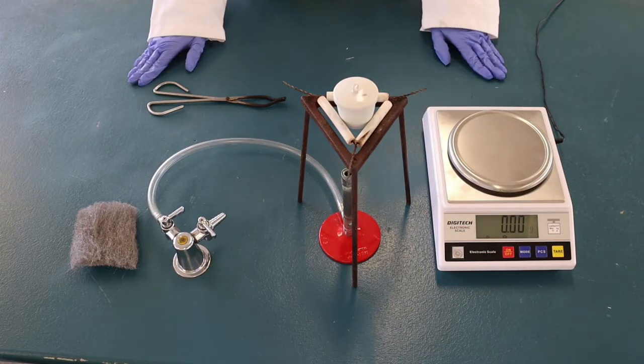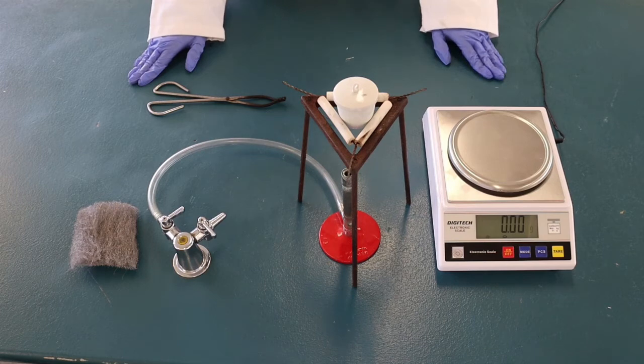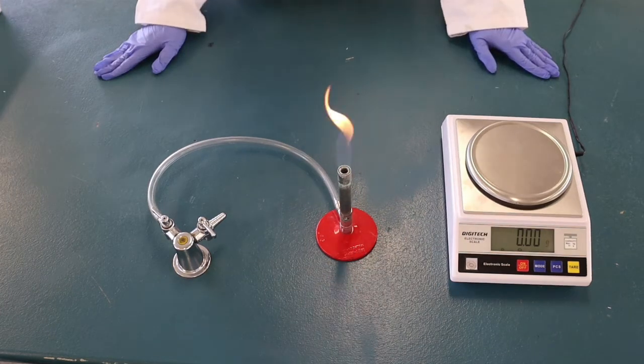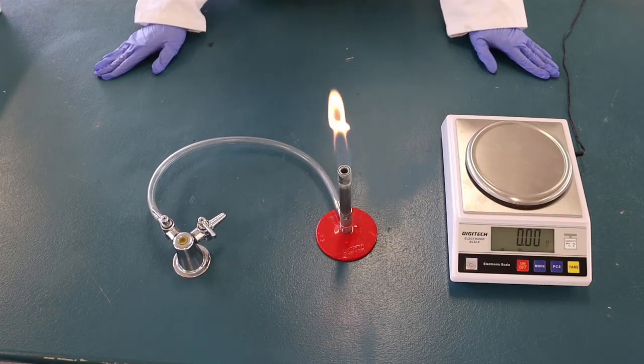If you wish to follow along with the procedure of this experiment, you can turn to page 242 in your Nelson Q-Science textbook units 1 and 2. First, we'll set up the Bunsen burner and turn on the gas and ignite the flame.